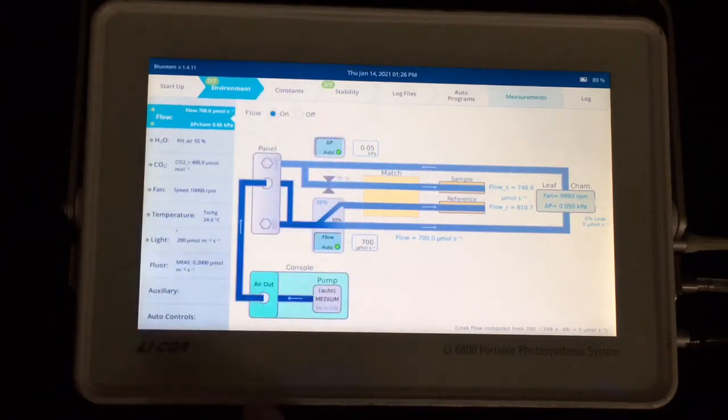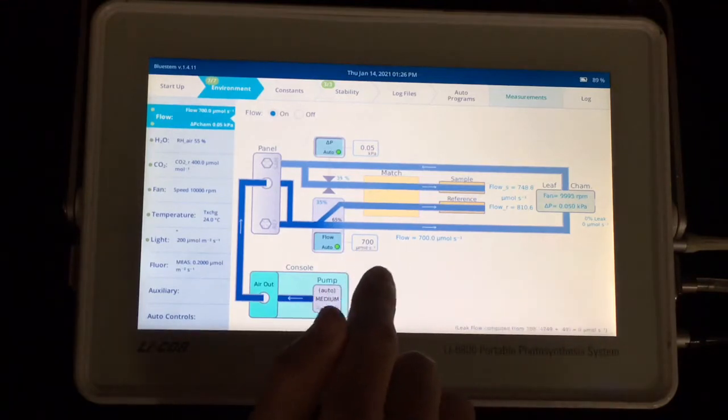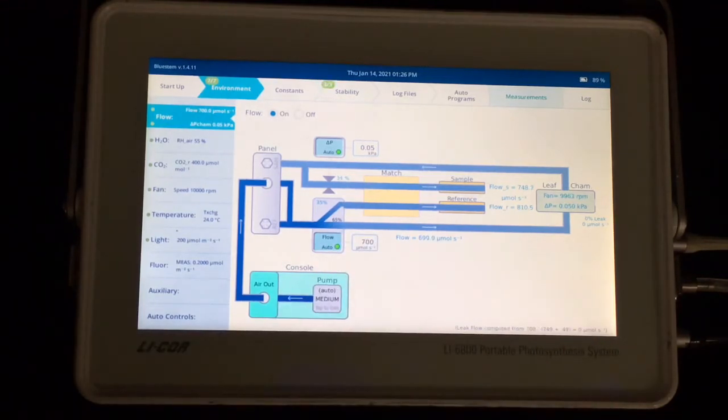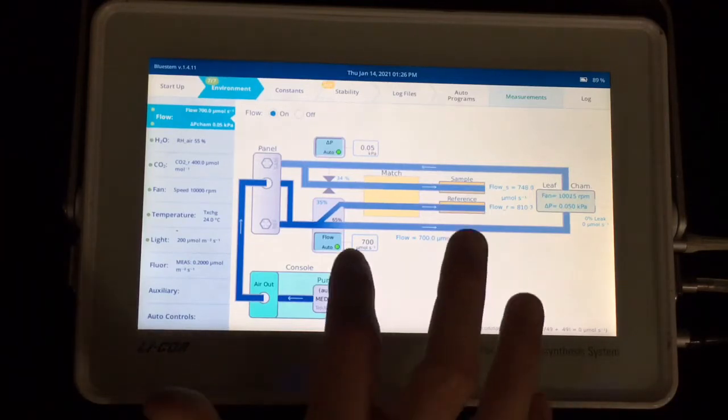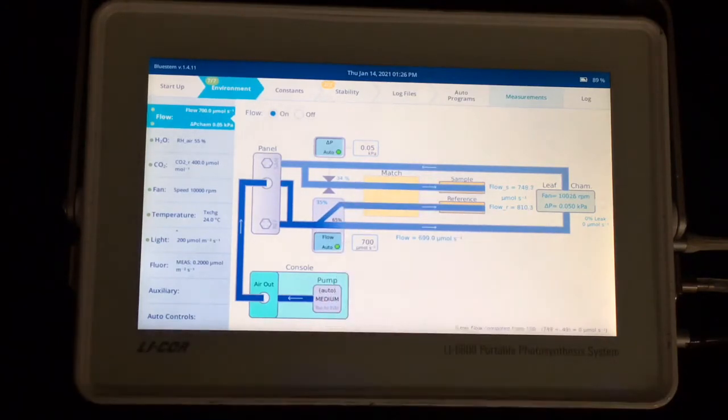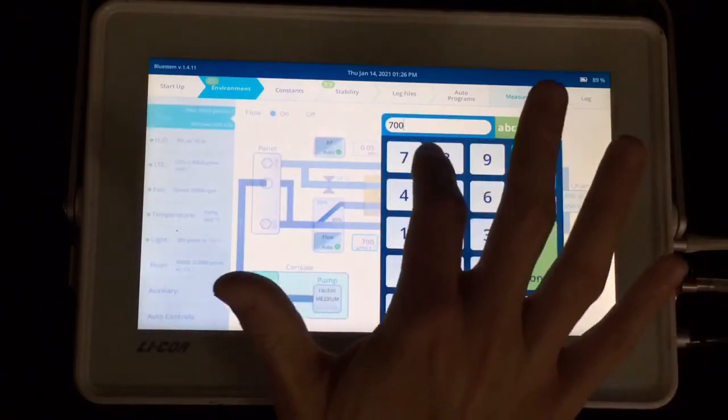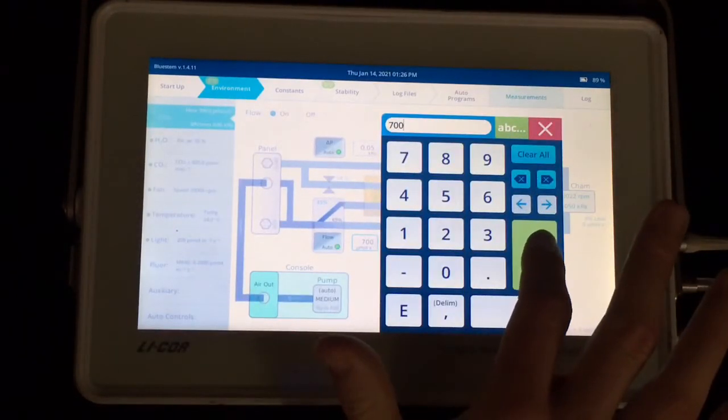And so the first thing we'll want to choose is a flow rate to our sample cuvette. And for a survey measurement, we would typically recommend being on the higher end of the flow rates. And that will act to flush the chamber more quickly, since you're going to be repeatedly opening and closing the chamber. The faster you can flush that sample volume, the more quickly your measurement will go. And so with the fluorometer chamber on the higher end of typical flow rates is about 700. So that's what I would choose. And you set that with this box here. I already had it set, but I'll just go ahead and reset that flow rate.